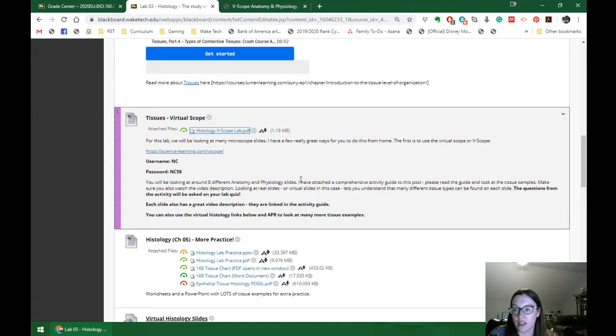8 different ones, I think. There's a comprehensive activity guide that tells you each slide to look at, and there's also a corresponding video description. You should definitely watch those.